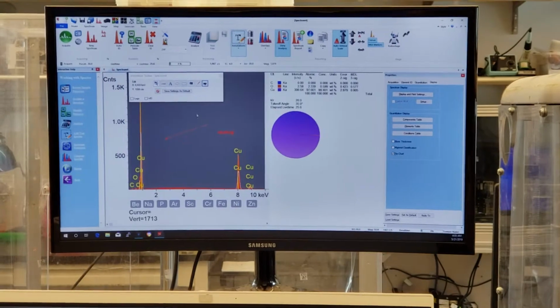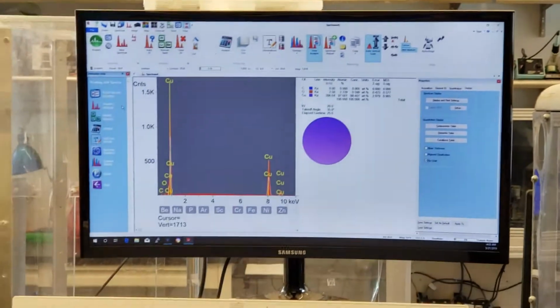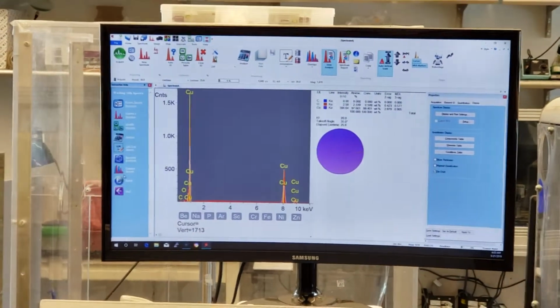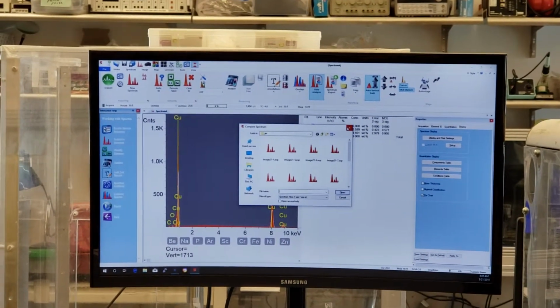But just know anyway that stuff is there. Let me just delete all the overlays for right now. So the next thing is spectra synthesis on the flowchart, and this window realistically should be create a spectra. And so if we go to spectra synthesis, sorry about that, I did the wrong thing.